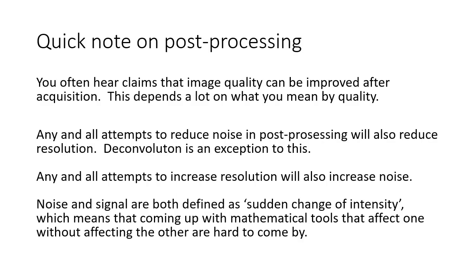And now a few final words to wrap up my talk. You often hear the claim that you can increase the image quality after acquisition. This depends a lot on what you mean by quality. Any and all attempts to reduce noise after you have taken the picture will also reduce resolution.